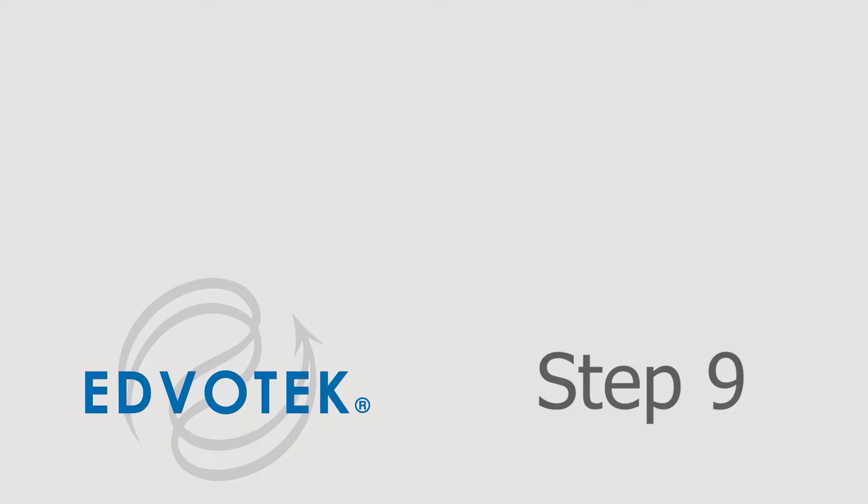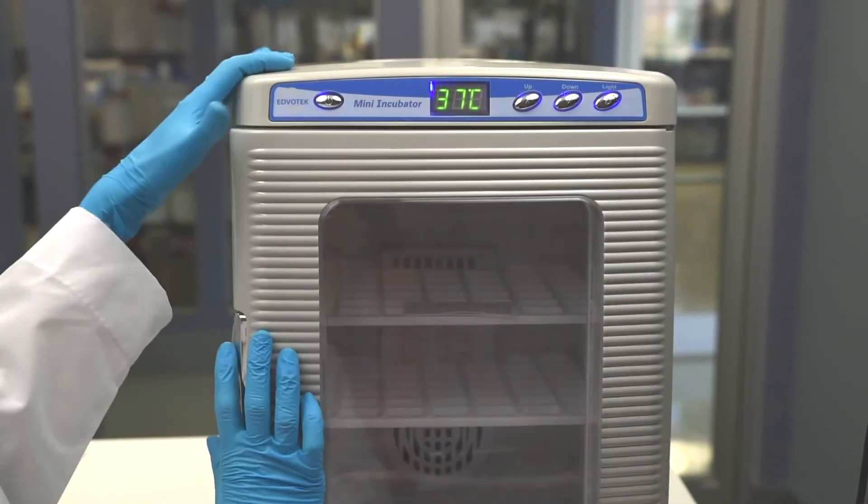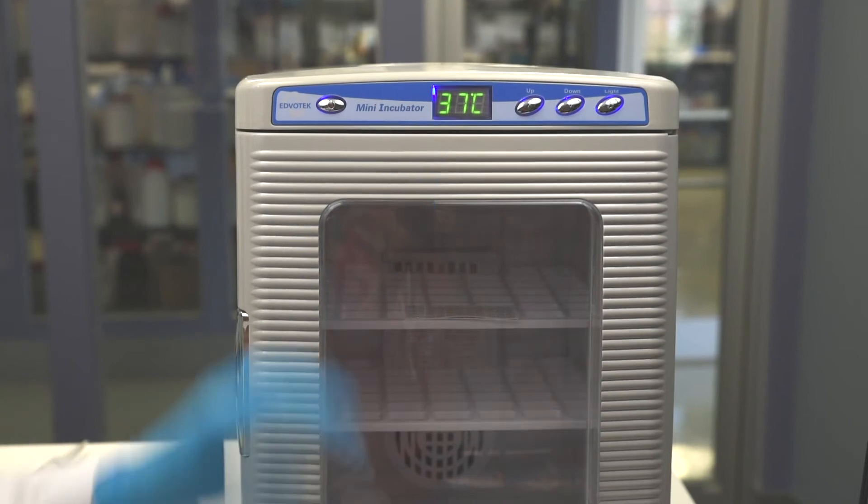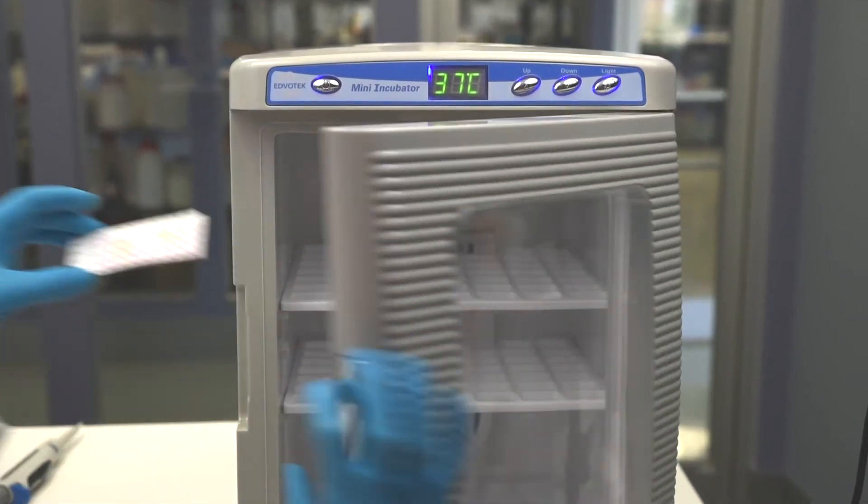Step 9. Incubate the microarray card in a 37 degrees Celsius incubator for 5 minutes or at room temperature for 10 minutes to allow the samples to completely dry.